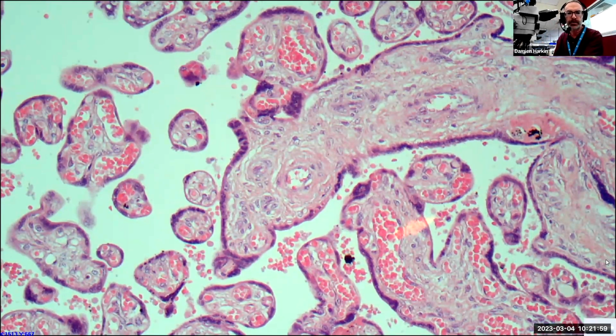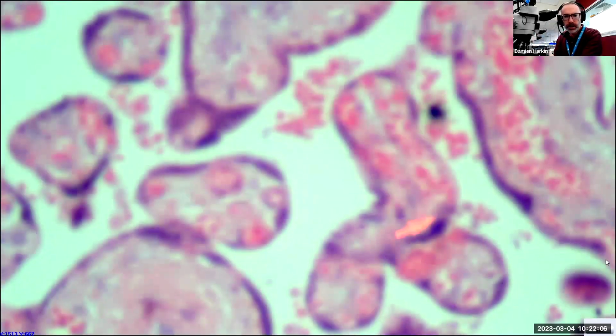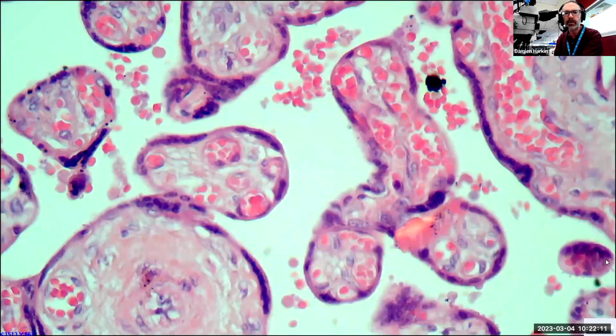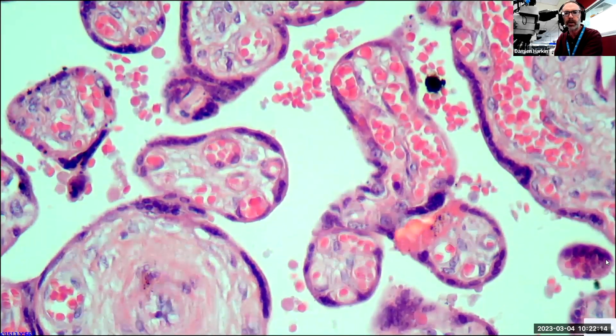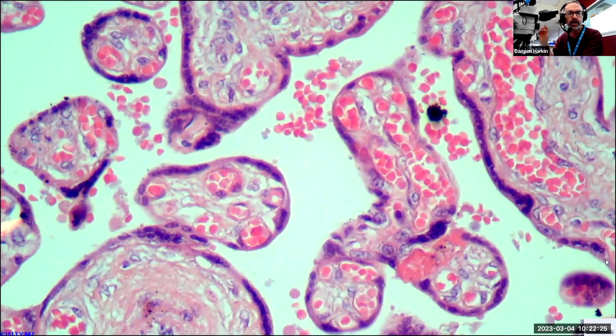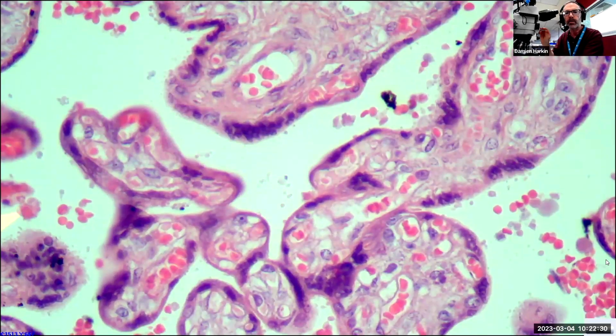But what I would like to draw your attention to, if we go back to the higher magnification, is that this particular block provides us with an example of formalin pigment. I've got a bit of a wonky stage here at the moment, but you see there are these black crystalline materials here, a little bit further on over on that side. Let's scan around a bit more over here as well. Now, is that a problem?